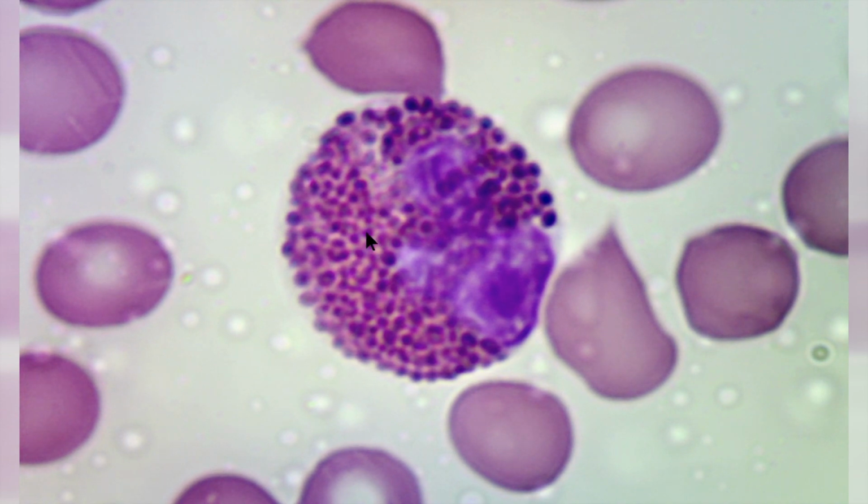The size of granules is very large. There are a few primary large dark granules, but the majority of these granules, the secondary granules that you can see here, not only are they larger, but their color is eosinophilic, which means something between orange and red. And that is the distinct characteristic of eosinophils.